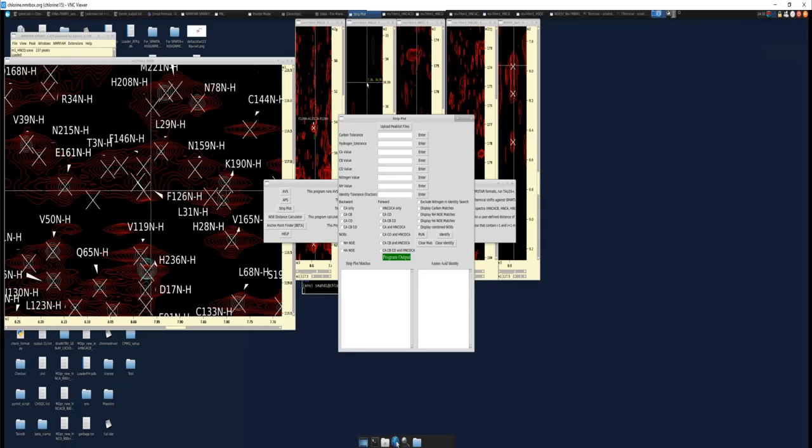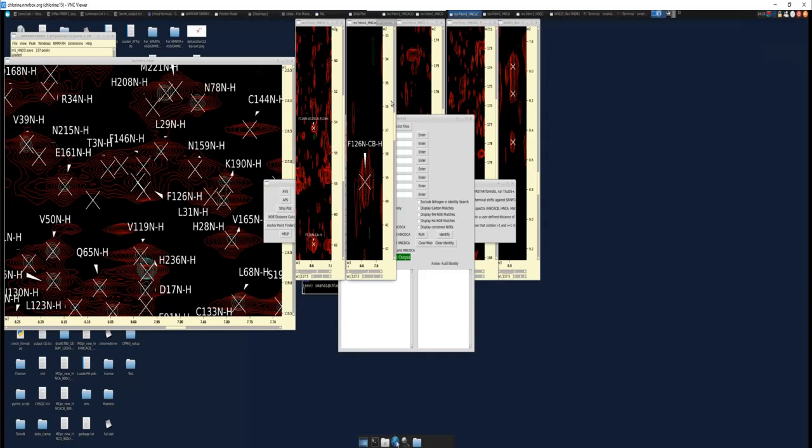Well, Sparky's strip plot has some limitations. So take, for example, here we have an HNCA and an HNCA-CB that's C-beta optimized, which means the HNCA has C-alphas and the HNCA-CB only has C-betas, as you can see here. If you search only the C-alphas or only the C-betas alone, you're going to get a lot of matches. What you would ideally want to do is search both the C-alphas and C-betas.